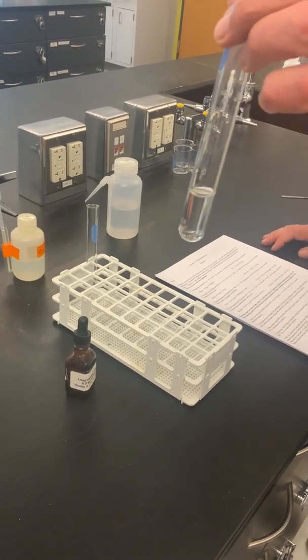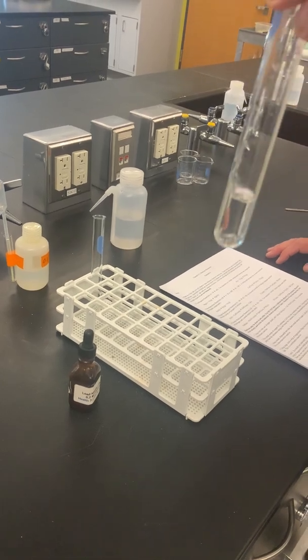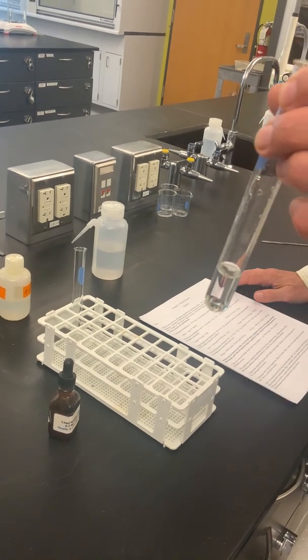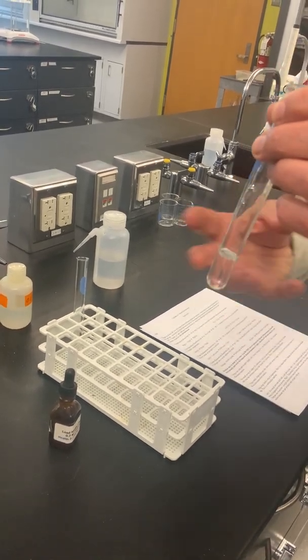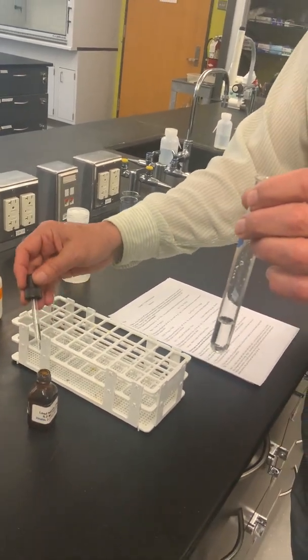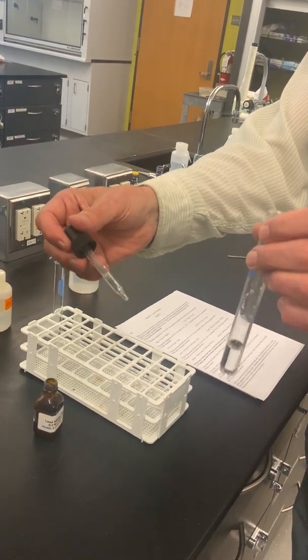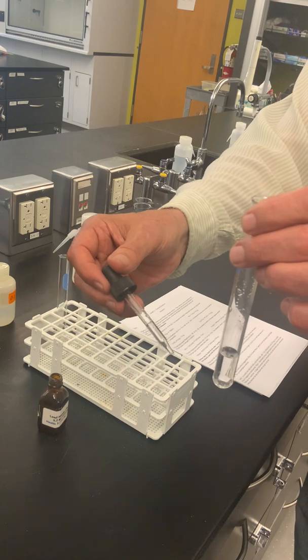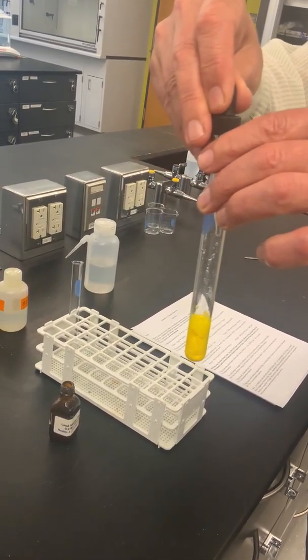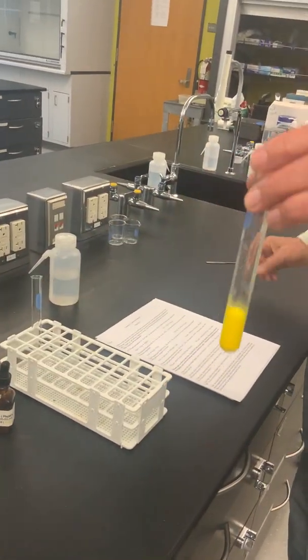You might note that nothing is visible. It is a more or less colorless, transparent solution because the sodium and iodide ions have been separated by the action of water and are now in that test tube. Here comes then the other reagent, aqueous lead 2 nitrate, which also is a transparent, colorless solution. And when we combine the 2, we see an immediate chemical reaction.